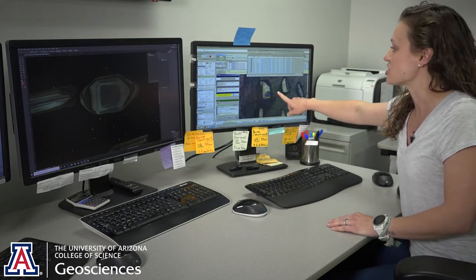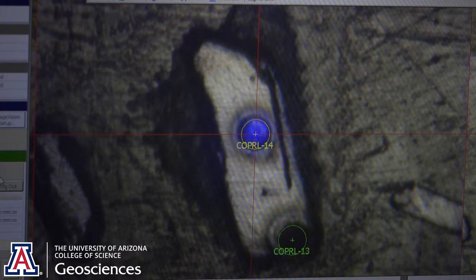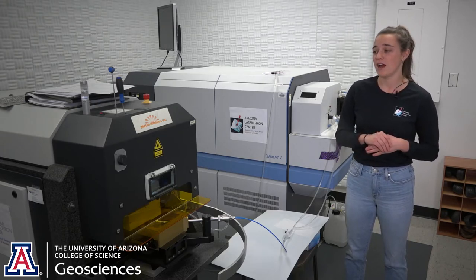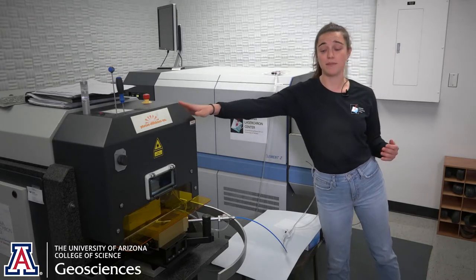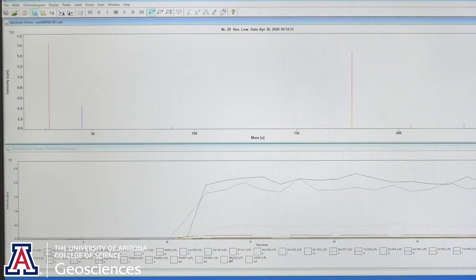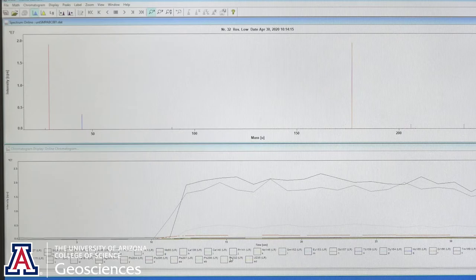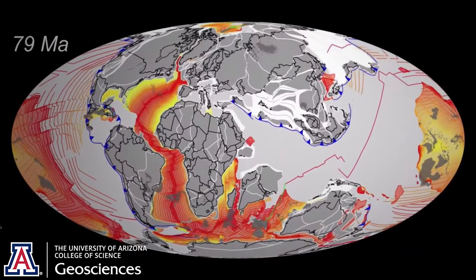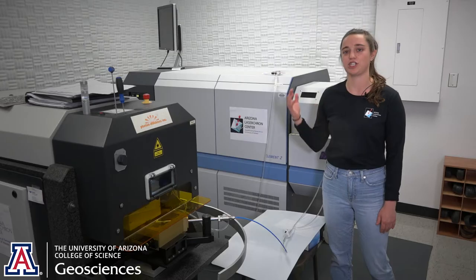On this computer we've chosen our spots and the run is already going — you can see the laser firing on one spot. Using the CL image we can tell exactly where we're shooting. In this rhyolite we picked about 100 spots with standards, and because it's all automated, you can actually pick your spots remotely from home or your own lab. In addition to the multi-collector mass spectrometer, we also have a single-collector mass spectrometer at Arizona LaserChron. It has the same laser and plasma setup, but instead of multiple detectors it has only one. We change magnetic settings throughout the run to sweep across different isotopic masses, allowing us to measure different trace and rare earth element chemistries in addition to our uranium-lead ages. This lets us look at long-term tectonic processes and magmatic differentiation in addition to uranium-lead geochronology.